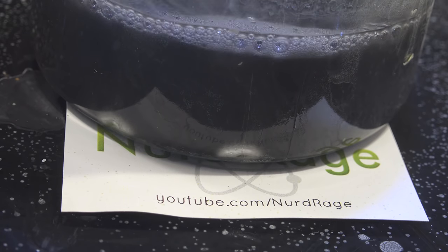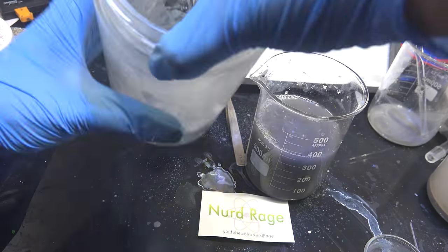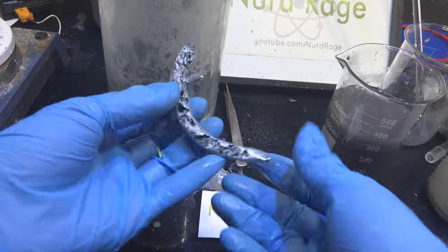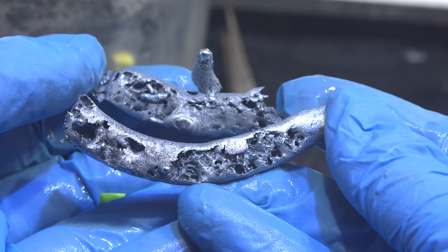Mine seems to have liquefied just fine, so I'm going to let it cool down until it solidifies. Now pour off the solution, and in the bottom we'll have gallium metal. This is very impure as there is still a significant amount of aluminum alloyed with it. But now that the gallium concentration is high enough, we can purify it with water.